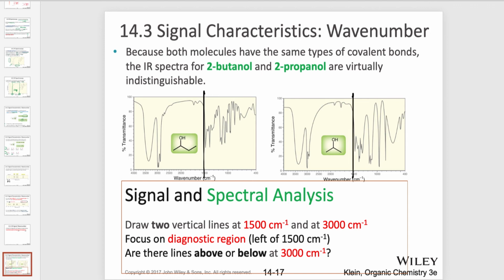These are very small, but you also have pictures in the textbook. When we're looking at this, we see that really these peaks are very important, and these are secondary. We can make assignments, but this is the diagnostic area. This is what we have to look at first and foremost, and then here too.